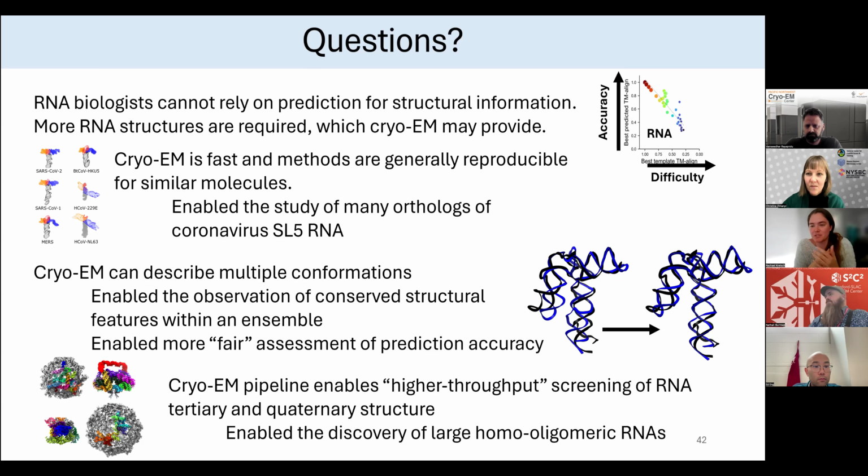So when you're doing your alignments, and you have a relatively simplistic RNA, such as our H-type RNAs that are literally shaped like an H, you can imagine there are some pretty obvious pseudosymmetries that can cause problems. So I'd say flexibility and pseudosymmetries are the main problem for these very small RNAs. But it has not been systematically tested, so hopefully someone will do that soon, and then we'll know for sure.